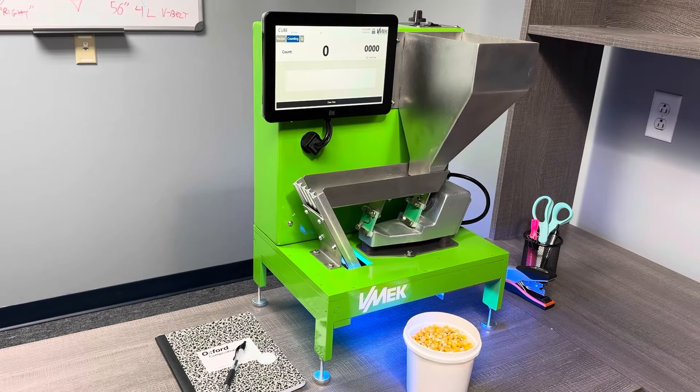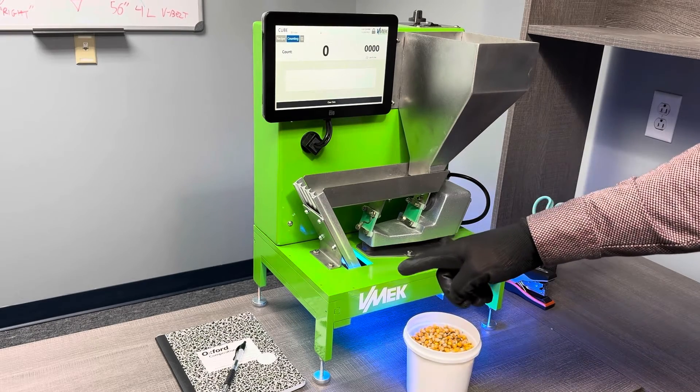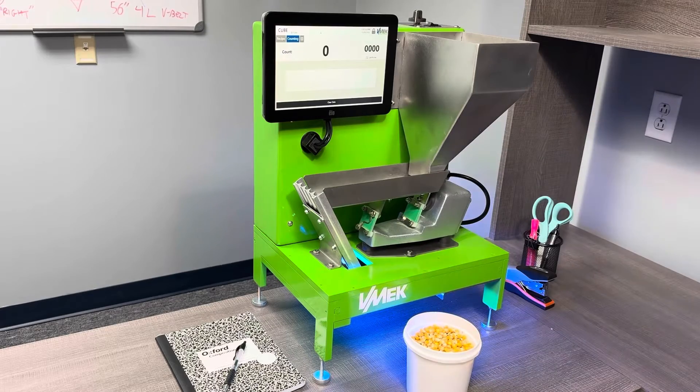Vmec is pleased to release its latest counter, the Cube desktop counter. It's small in size, only 16 inches by 13 inches by 23 inches in dimension.